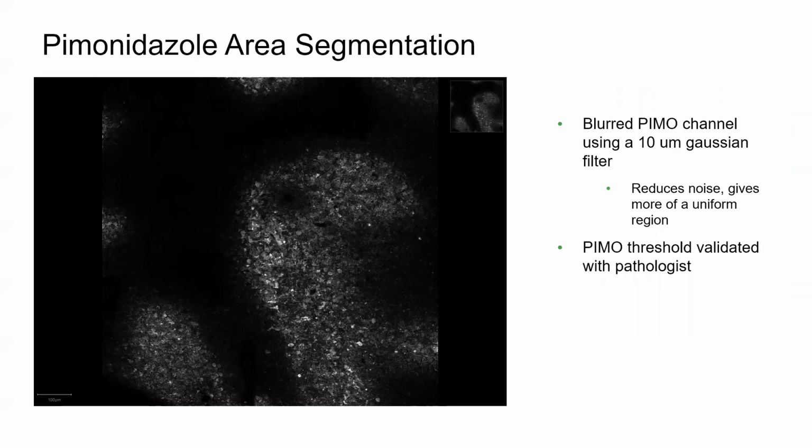So as a first step in this workflow, we wanted to identify regions of hypoxia, but these could be regions of other structures in your tissue, such as tumor versus stroma, or anything you could elucidate in imaging mass cytometry datasets that you might have.